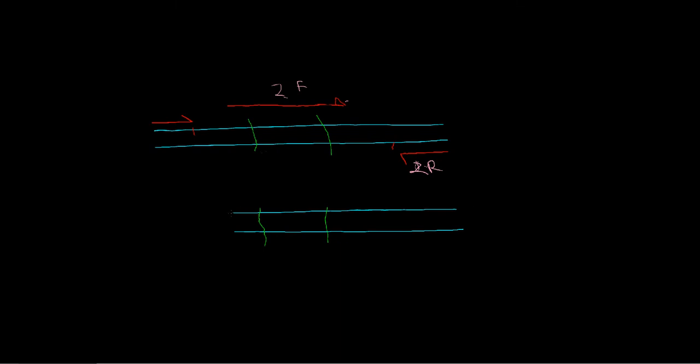And this chunk is going to have about 20 base pairs upstream of the area that we want to mutate, and 20 base pairs downstream of the area that we want to mutate, and we get this area that we're going to mutate. And we're going to come back to this in a second.